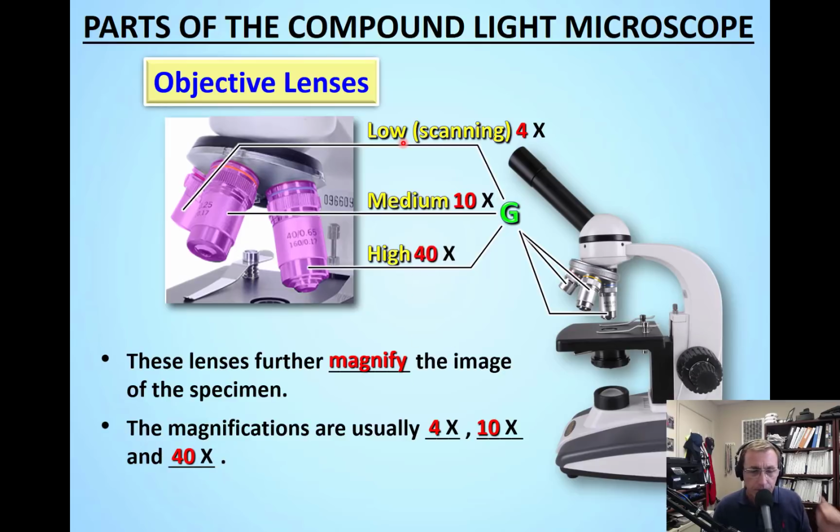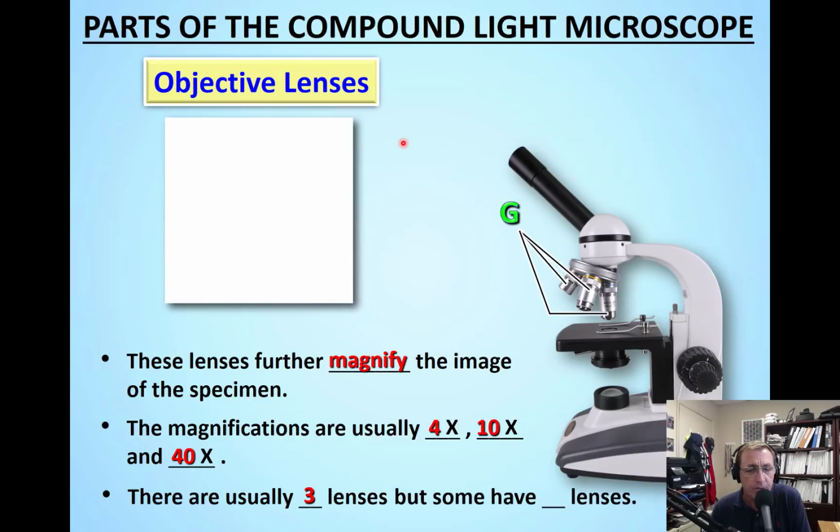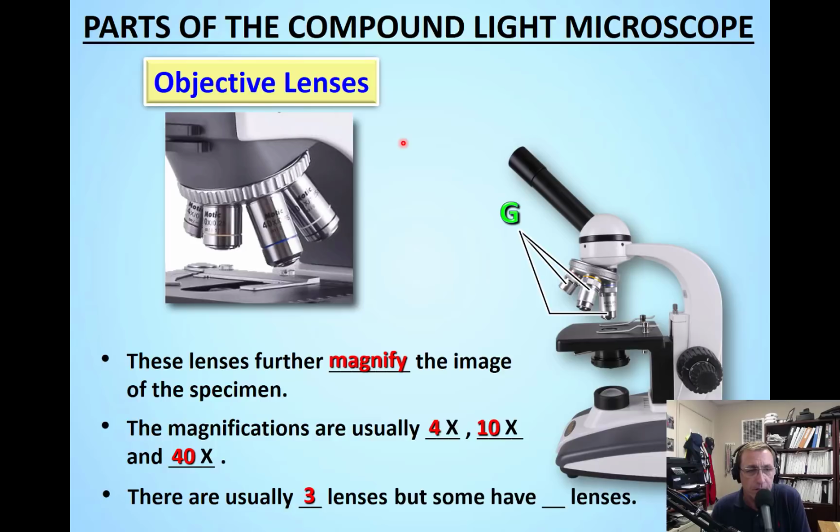So our student microscopes, I think I might have said microphone somewhere in there, but the microscope, the objective lenses are exactly like average. The teacher one, though, is not. Okay, there are usually 3 lenses, as you might imagine. Every picture we've had has the 3 lenses. I think our teacher one, if you go back and look, pretty sure it has more than 3. I think it actually has 4 of those objective lenses. Okay, but some have 4, and you can see that there, that they have the 4 lenses. This rotating nose ring has 4.